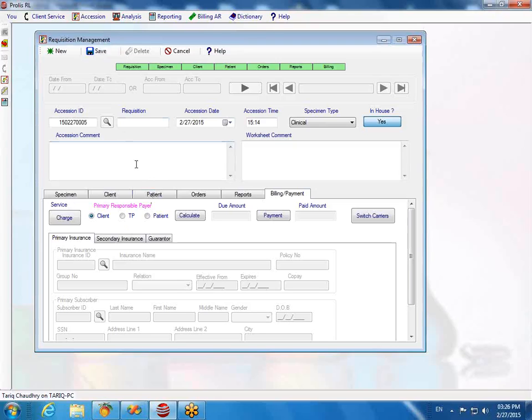In an effort to minimize the input time, we have made good usage of default values. So your accessioner doesn't have to spend too much time accessioning. Literally, when an expert user does the accessioning, it takes from 20 to 25 seconds per accession. It's a very good feature. So when you have the save button available, you simply click the save button and the accession will be saved.